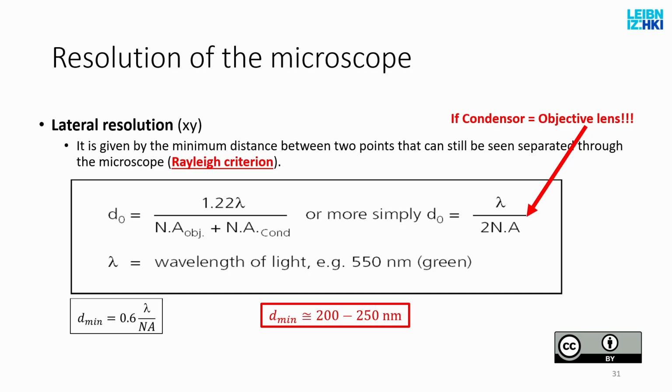Prices, how much you pay for a system, how often you will use it, and what the typical usages are will determine what you actually need. Just like we don't drive a Lamborghini to go to the clinic, to go to work. We drive a Volkswagen, whatever. I would love to have it, but what am I going to do with it in those cases?